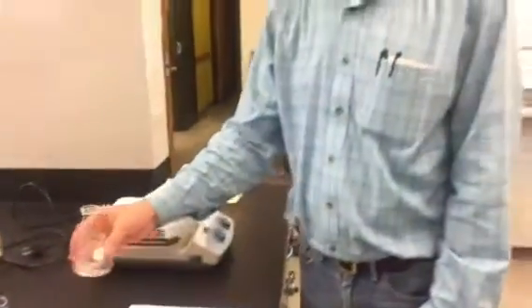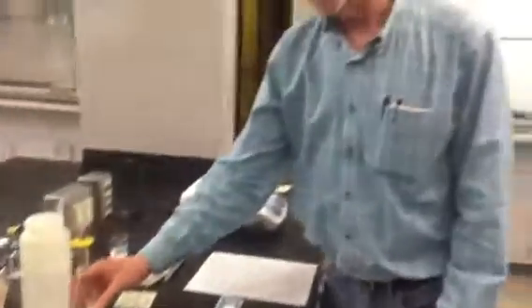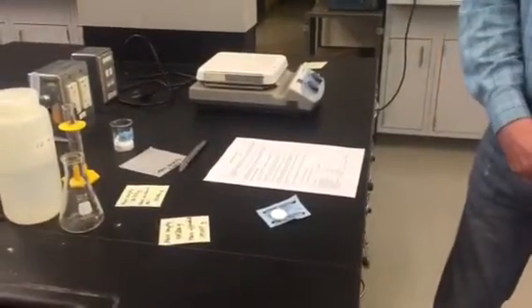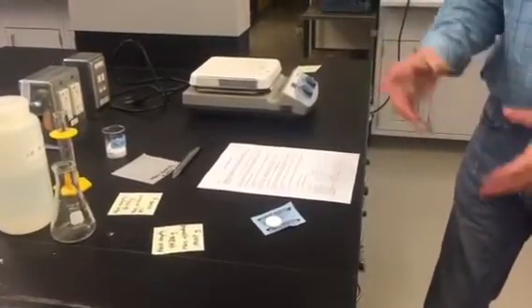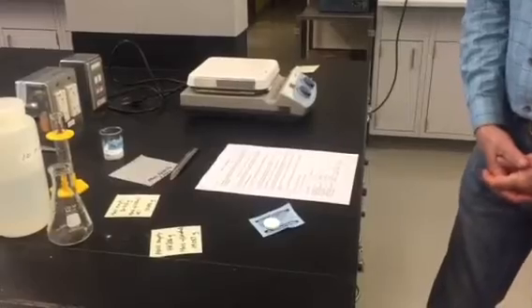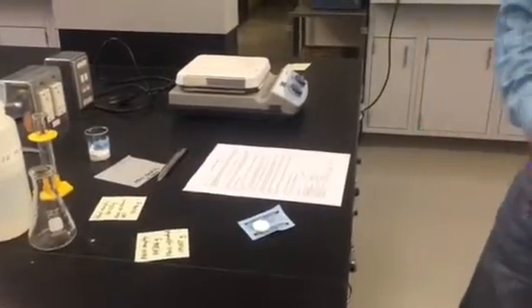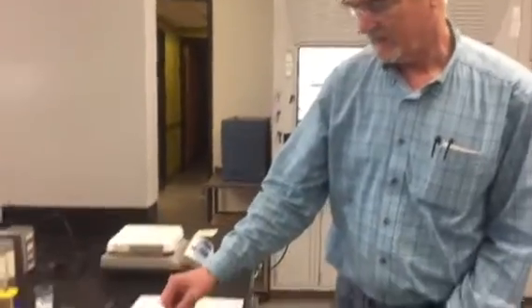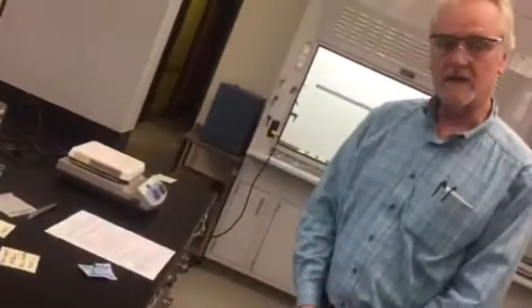This reaction mixture can go down the drain because it is completely harmless, and then you'll do the exact same procedure again, only in this instance you'll use one of the commercial antacid tablets that we have, and repeat this exact procedure to figure out again whether or not the amount of active ingredient in the antacid, which is listed on the label, is verified by the experiment.